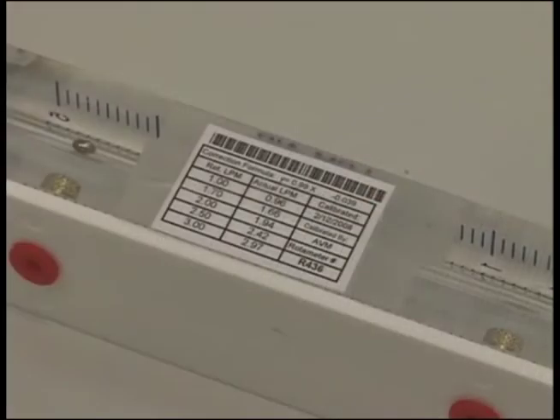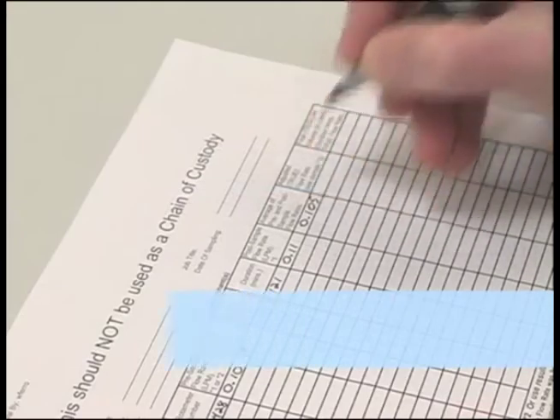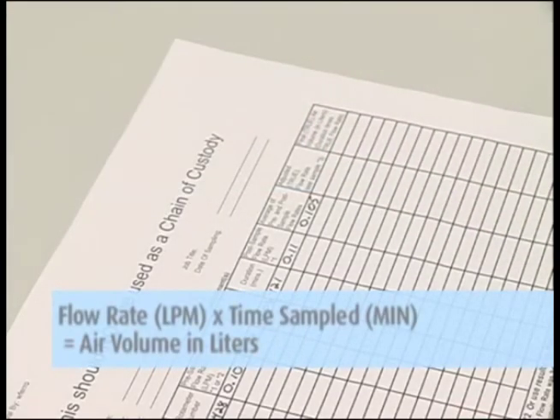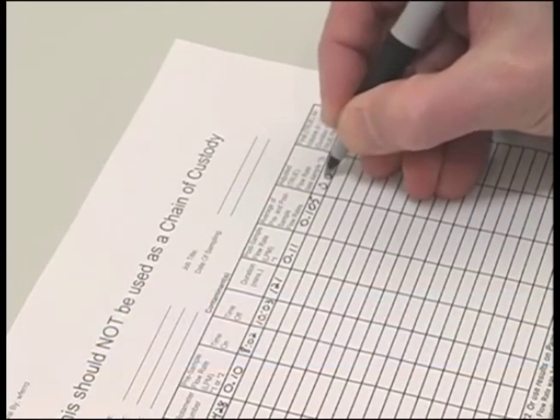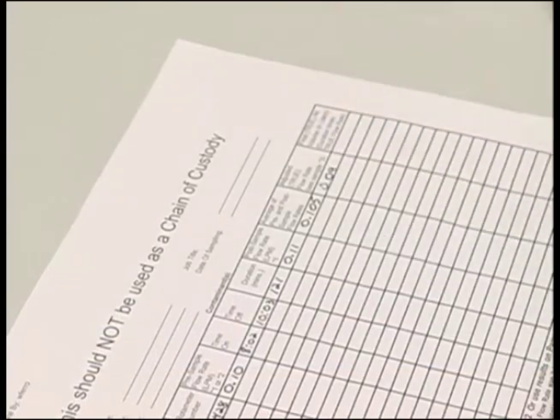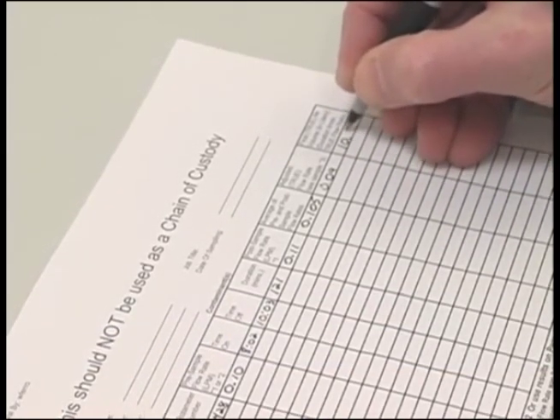All rotometers are calibrated against a primary standard quarterly. This calibration formula is located on the side of the field rotometer. Take the average rotometer reading and plug it into the calibration formula found on the side of the rotometer to determine your actual flow rate. Multiply the flow rate in LPM by the total time sampled in minutes to get the air volume in liters. Record the total liters on the field pump data sheets and the chain of custody.